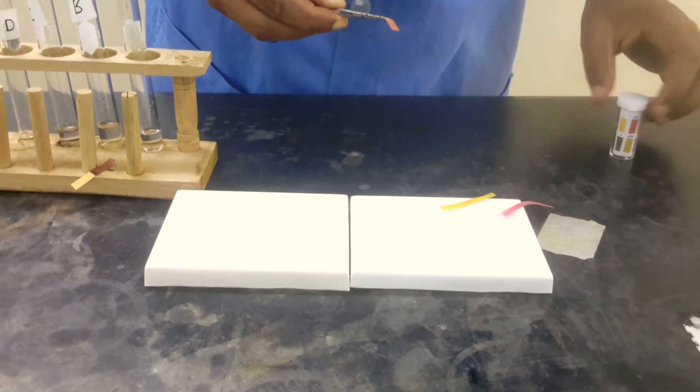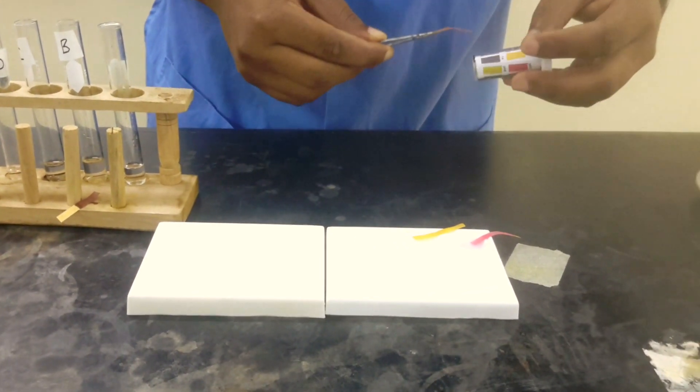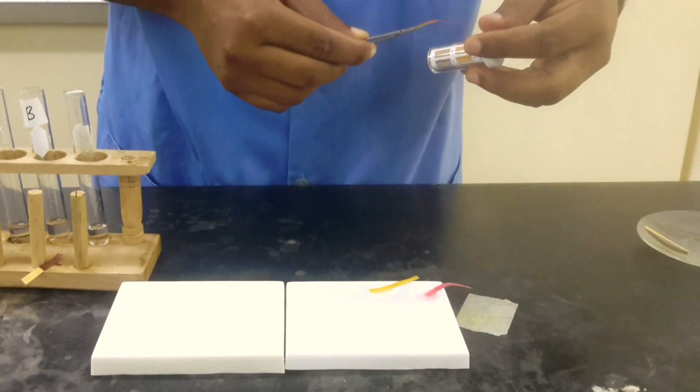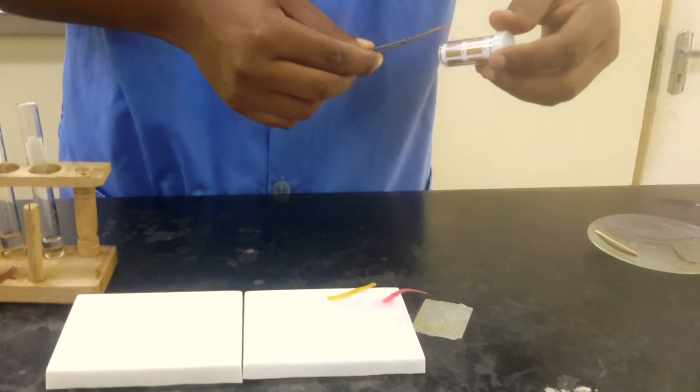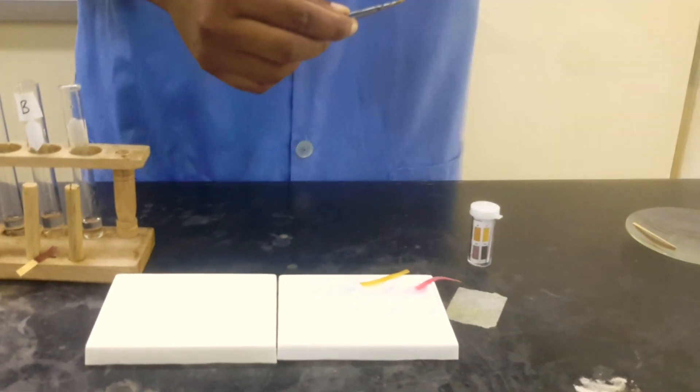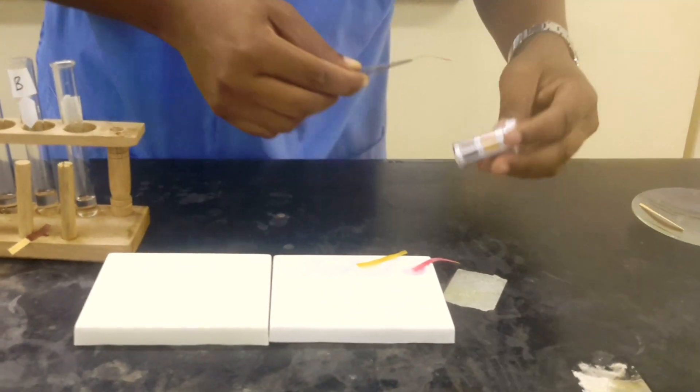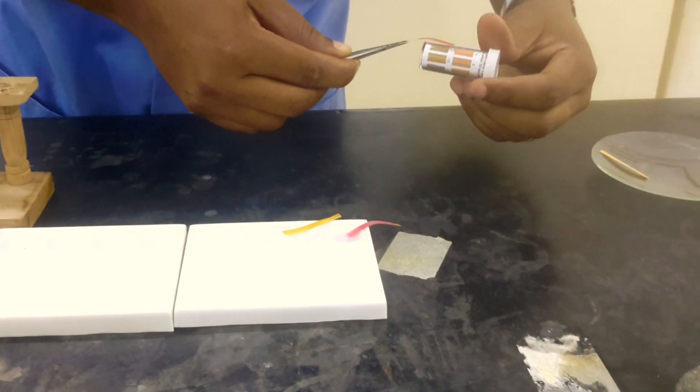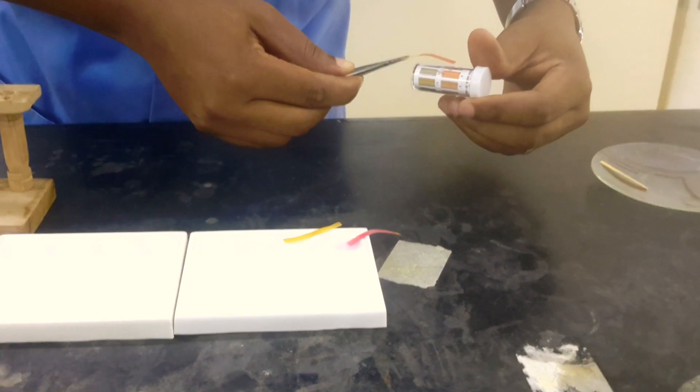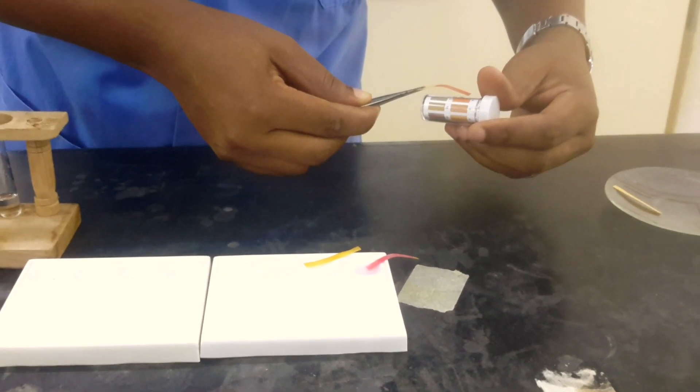So for D, we dip and we're going to match to see which color that corresponds with. Now this is looking like, let's see, like four.